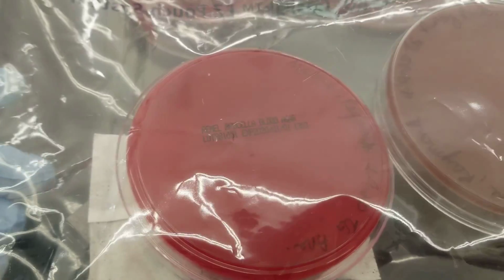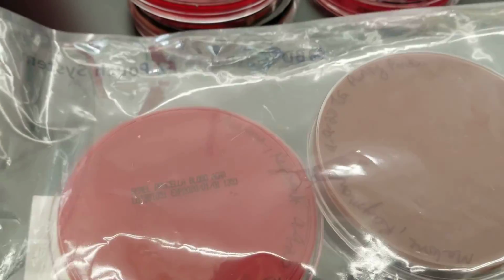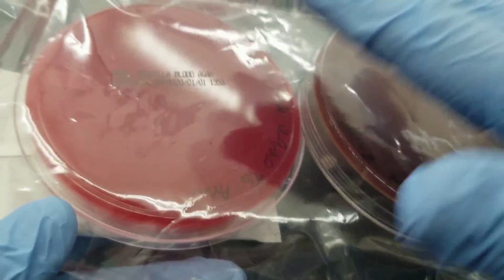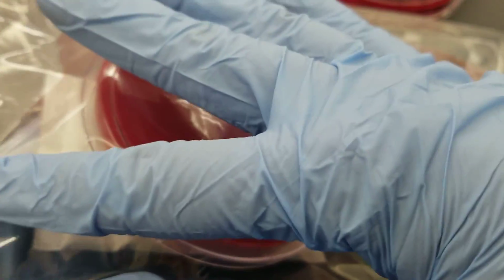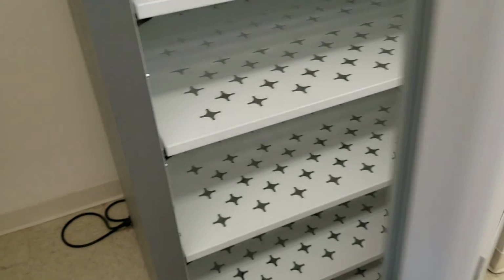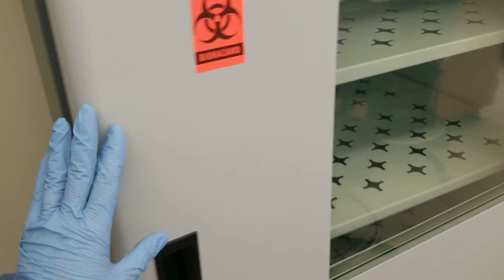So what I'm going to end up doing is I'll take this and I'm going to put this in a normal O2 incubator, but again, since it's already in the bag and it's got the gas pack and the indicator and it's sealed in there, it should create an anaerobic environment. So we're going to do that. So I've got my O2 incubator. I'll put it up here. All right. I'm going to close it up.